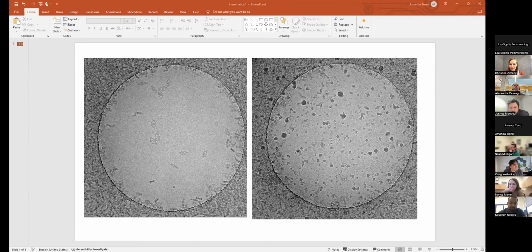It's all as low as it can go. I guess also partly maybe the cryo boxes, there's something a little bit off, or it's not correctly reaching temperature. The cryo box on the F20s isn't temperature monitored. That's part of Sean's point, the cryo box is probably considered part of the vacuum system in a way, but I think while you're imaging, things are depositing and sticking to your grid while it's in the scope.